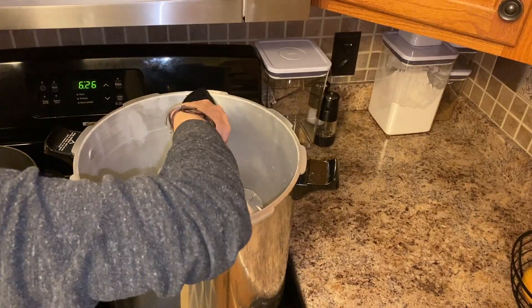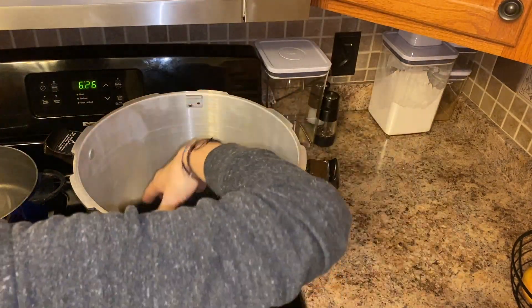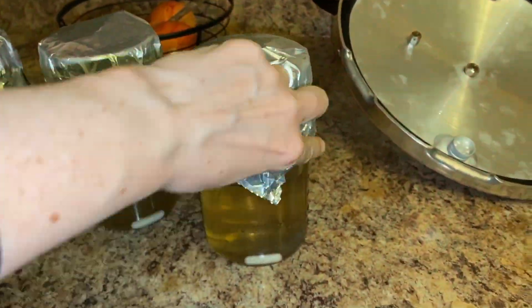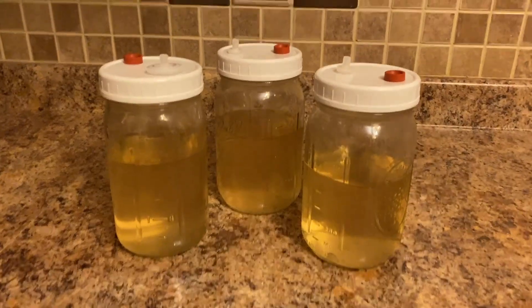Cooling it down to room temperature can take anywhere from 12 to 24 hours. If you add a live culture or spores when the liquid culture is too hot, you can end up killing the mycelium. After it's cooled to room temperature, it's ready to go and now we can add our live culture.